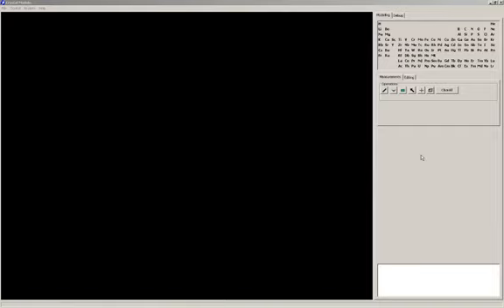Welcome to the demonstration of the beta version of the crystal module. We're going to create first the unit cell of a cubic system.